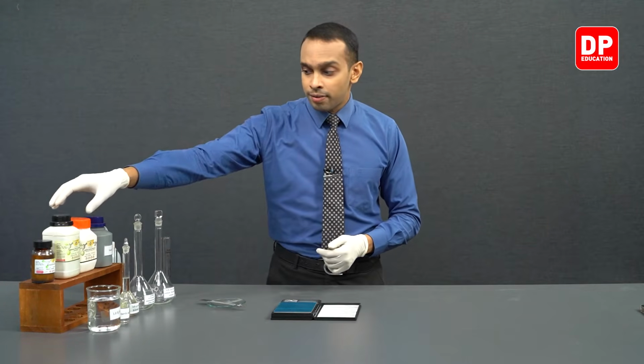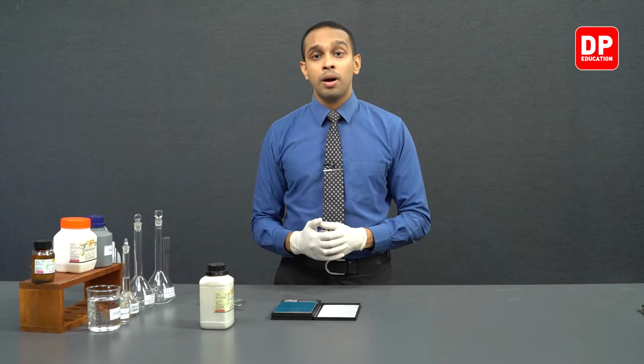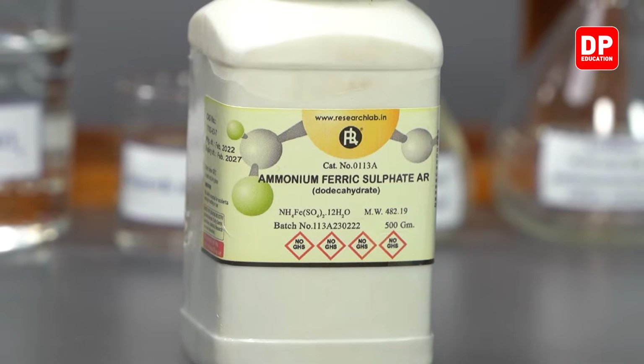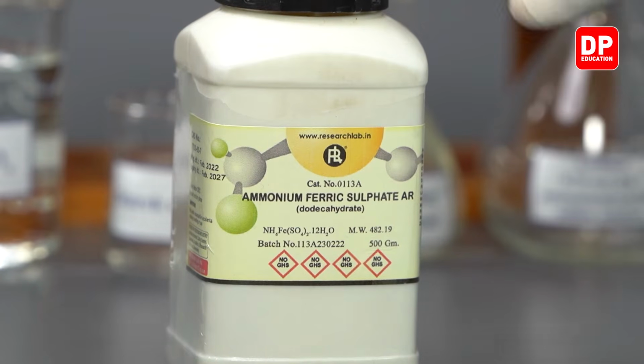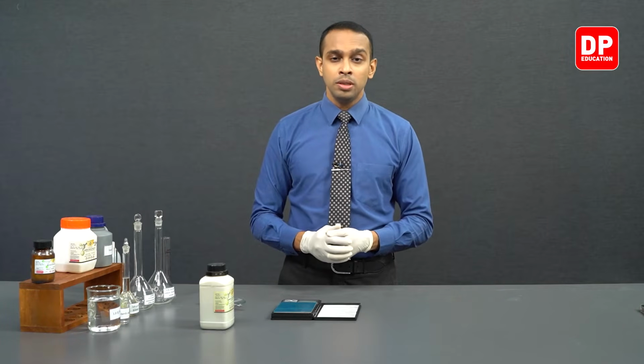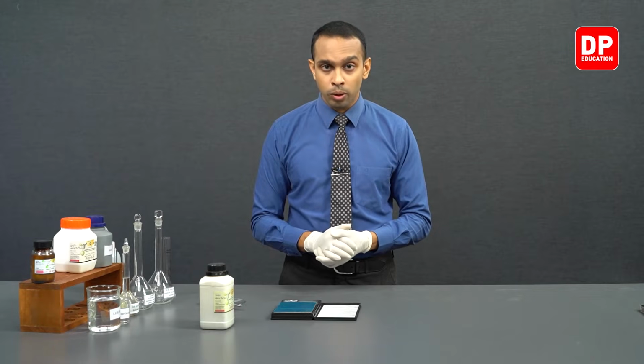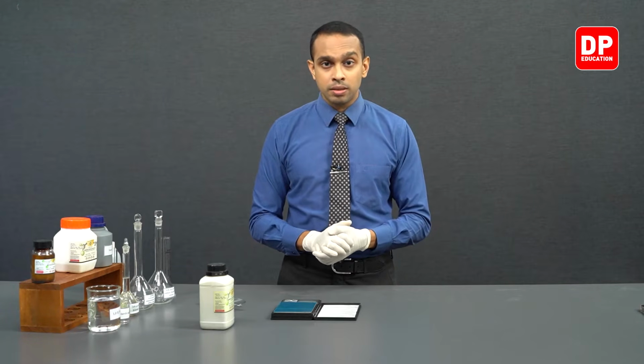So we have our ammonium ferric sulfate, or ammonium iron(III) sulfate solid sample here, and this particular solid sample is a hydrated sample, so the formula would be ammonium ferric sulfate 12H2O, and the molar mass is 482.19 grams per mole. We aim to prepare a solution of 0.1 moles per decimeter cubed concentration, and the volume would be 250 milliliters.